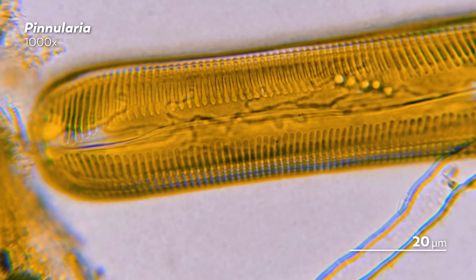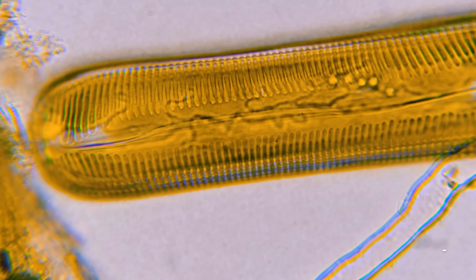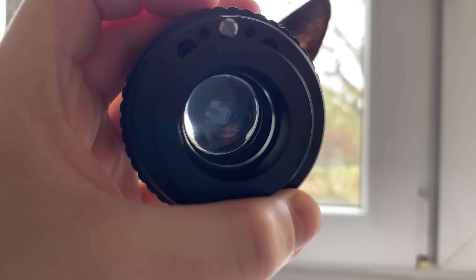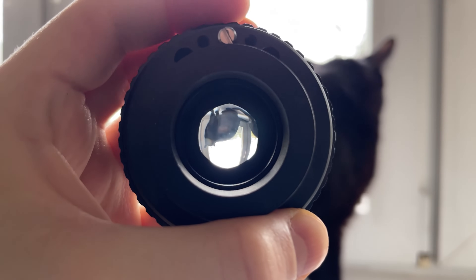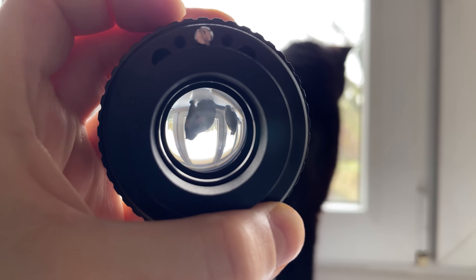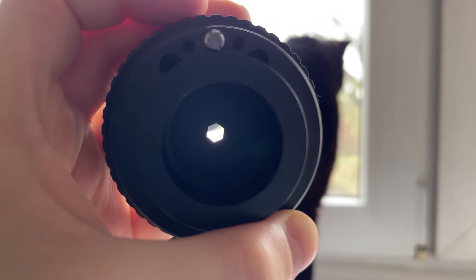Now once you have your slide on the microscope stage, the next thing you'll want to play around with is how much light is reaching the slide, because that will influence the quality of the image you see. With too much light, all the little details, like the ridges along this pineal area, might get washed out. Now one thing you can do is just dim the light source, but the tool that's really going to help you adjust the amount of light is the condenser diaphragm, which James is helpfully demonstrating here with the help of his cat.